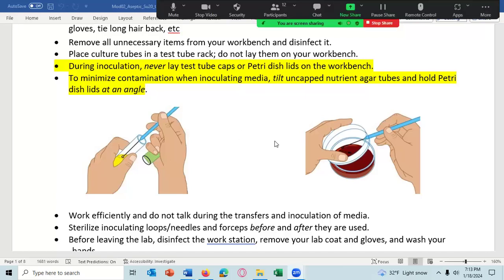Now, if something falls down from the air, it's most likely going to fall on the top of the lid, and who cares, because that's contaminated already. There's bacteria on the lid already. The only risk you have is if something falls directly in this region here, it would drop into the plate. But it's much less than if you took the whole plate open and exposed. Any question about any of that?